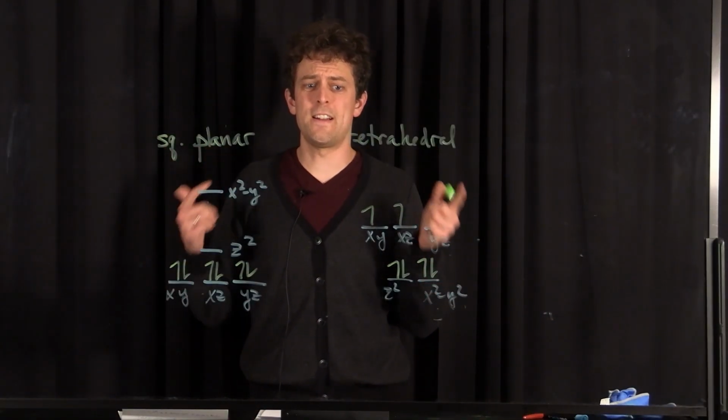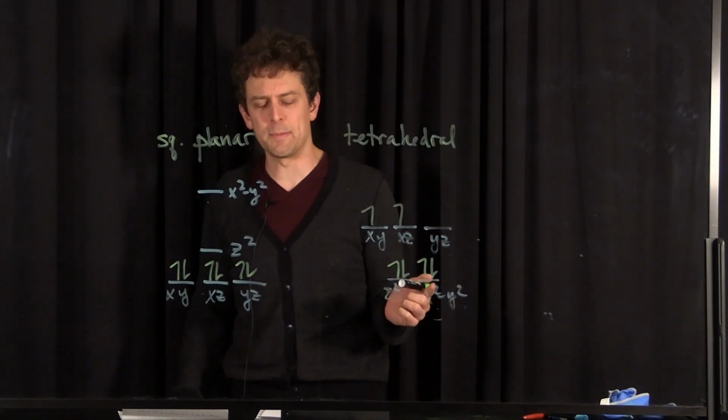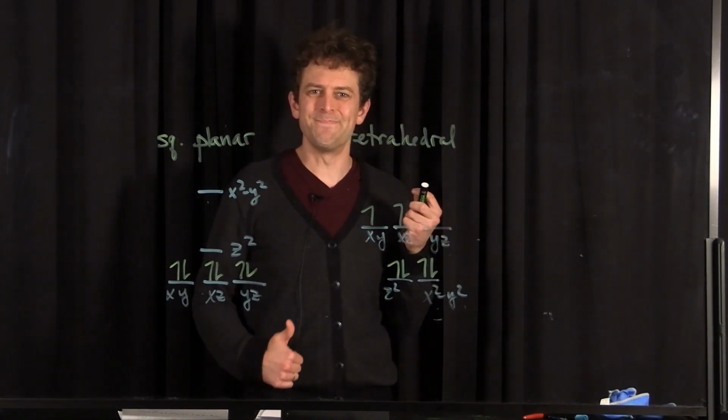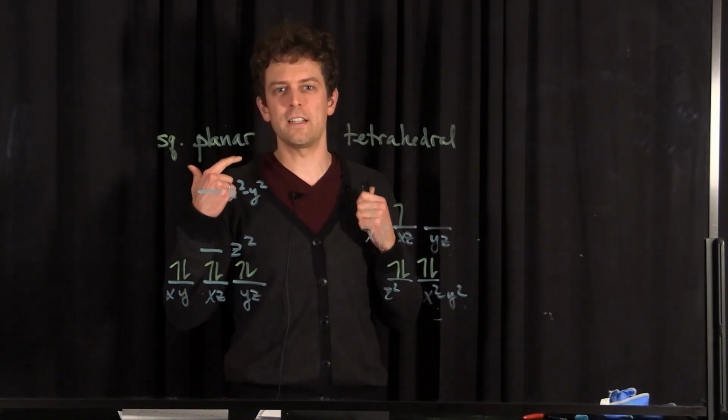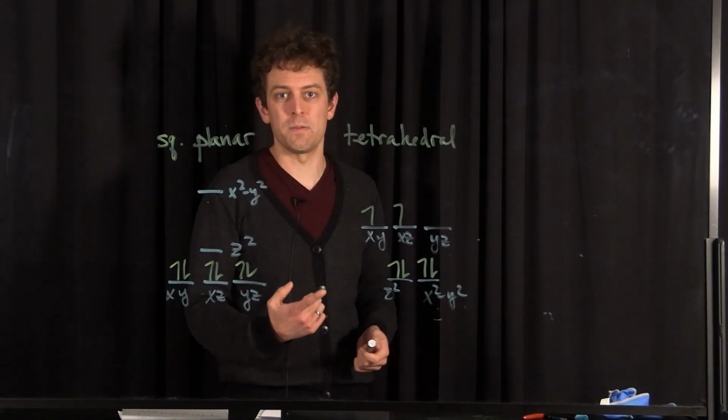So we're ready now. We're left with just our square planar and tetrahedral d orbital splitting diagrams. And now we can figure out how to use that weird data that I collected on the NMR spectrometer to tell me how many unpaired electrons I have in my complex, right?